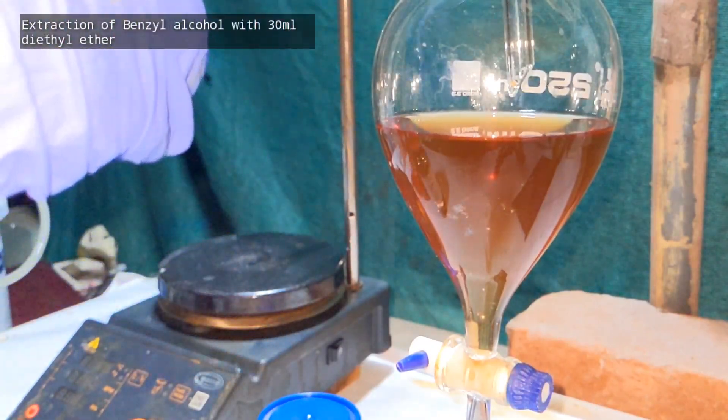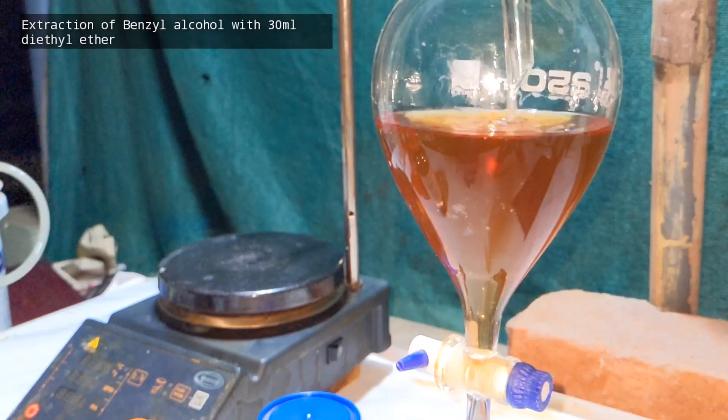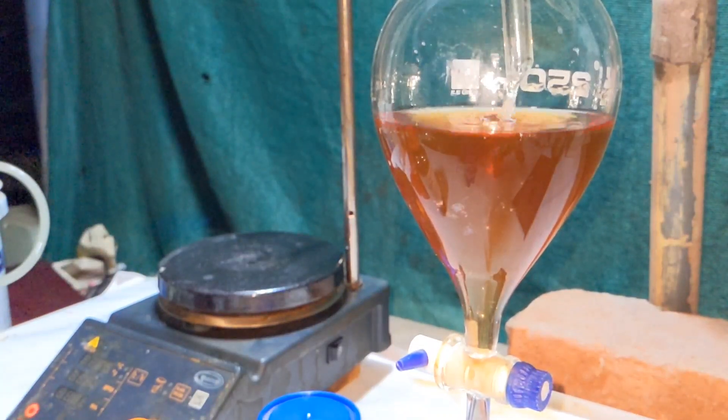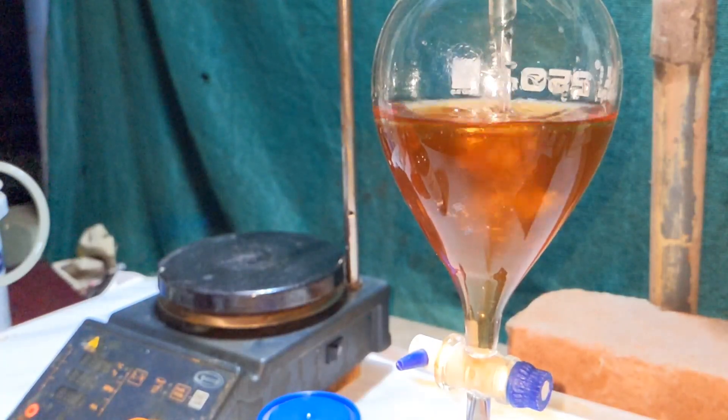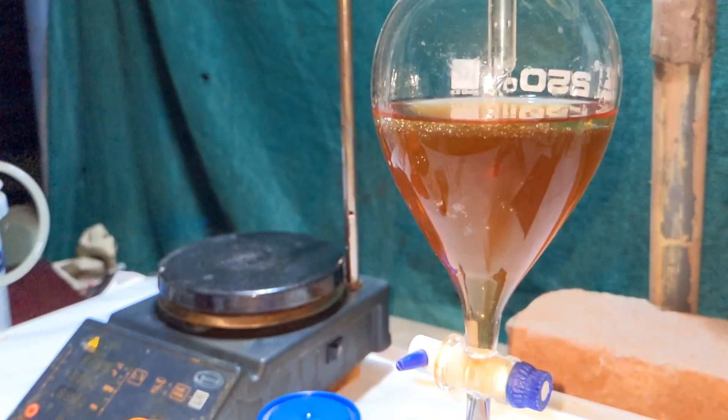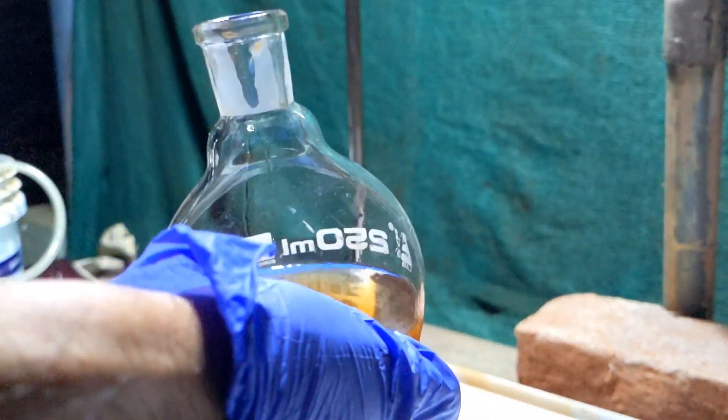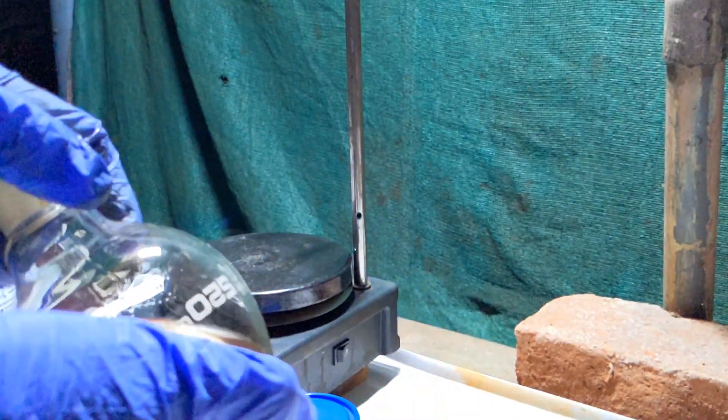We have to wash the contents of the separatory funnel 5 times with 30 ml of diethyl ether each time. Here I have added the first batch of 30 ml of diethyl ether. The separatory funnel was then taken out of the clamp and it was capped and then shaken with frequent venting to release the internal pressure.